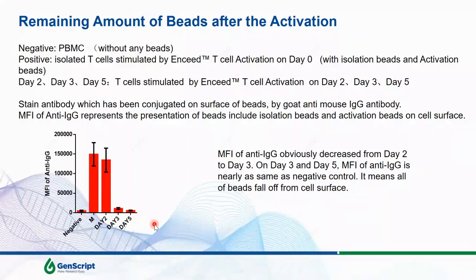Thank you, that is a very good question. All right, thanks, Dr. Yu. Another question: are all the isolation beads for PBMC use? Can we use them for other starting materials, for example, cord blood? If so, do we need to do our own optimization?